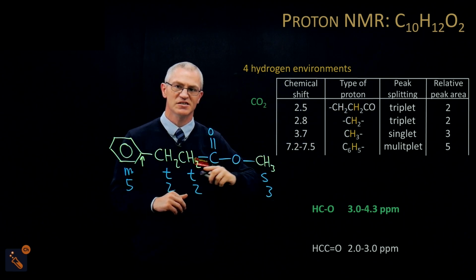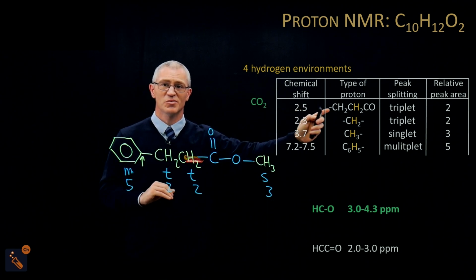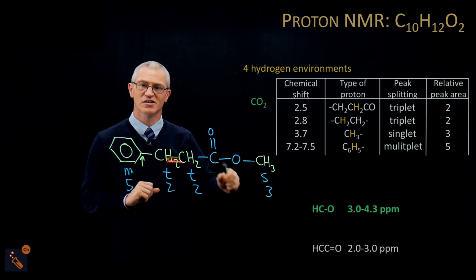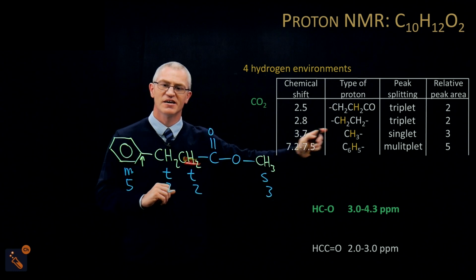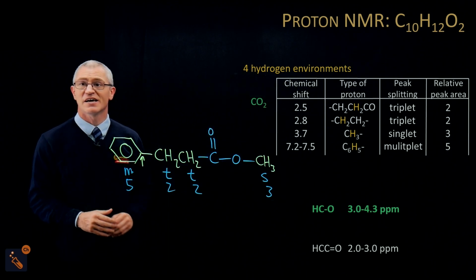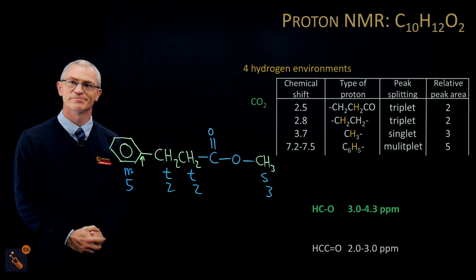I've said, look, this CH2 bonded to the CO is the first one, and I don't have to put the benzene in if I don't want to, because I've chosen that CH2, I can just choose the other CH2. Remember, I'm highlighting it here. You'd probably underline the hydrogen in yours. And that means it's totally unambiguous. So because it's totally unambiguous, it's worth a mark. And that is how you complete this question and find out the ester using the different ppms.